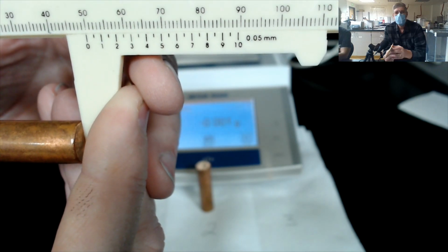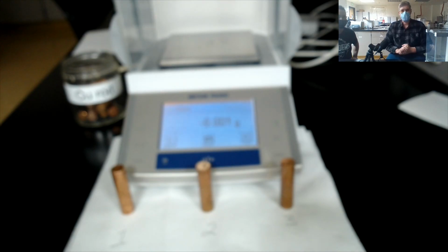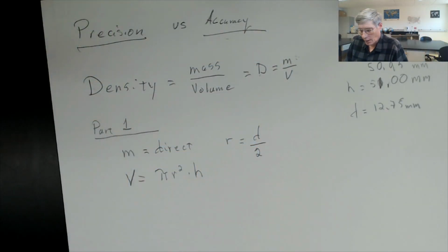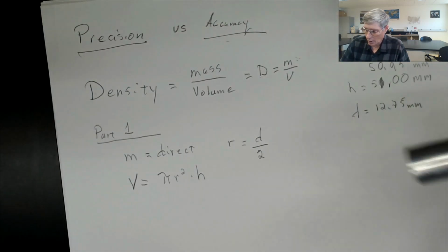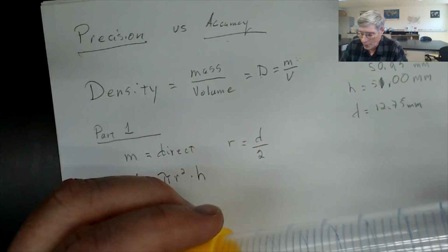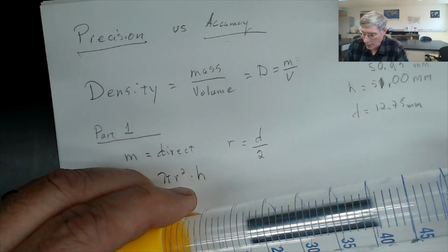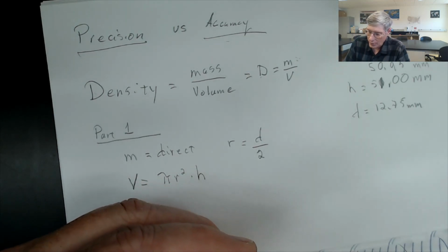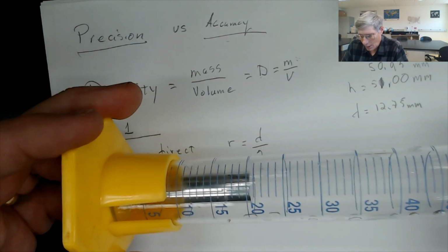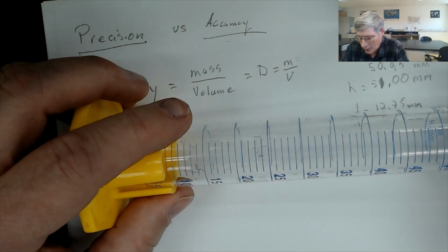All right, that finishes the measurement of the diameter and the length, from which you should be able to calculate your volume and your density. The other method that's going to be used to determine the density of these is volume displacement. The way volume displacement works is if you have some liquid at a certain volume and you add an object without breaking the container, the object will increase the volume proportionally. You will need to record those 2 volumes from the video of the actual experiment.